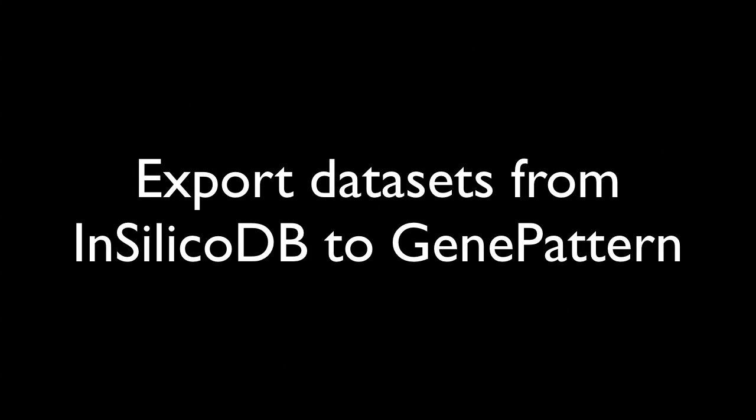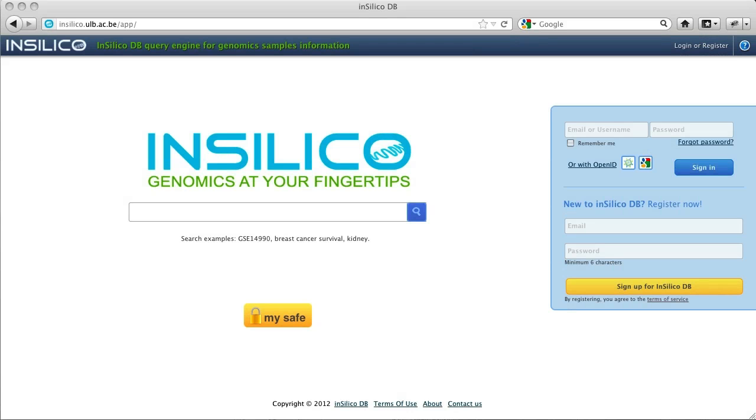In this tutorial, we will demonstrate how to export data from InSilicoDB to GenePattern and create a heat map with that data. InSilicoDB is an open platform for managing and analyzing genomic datasets. It contains thousands of public samples and provides connections to analysis tools such as GenePattern.